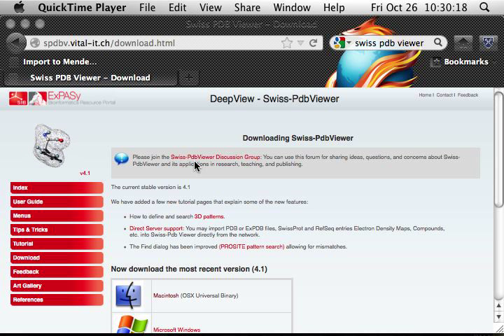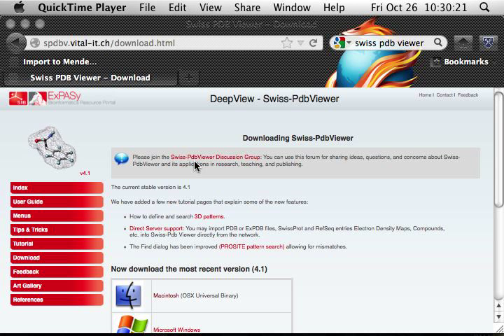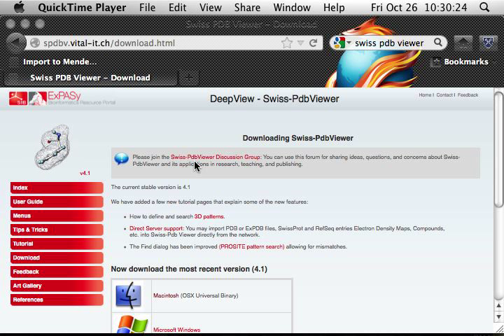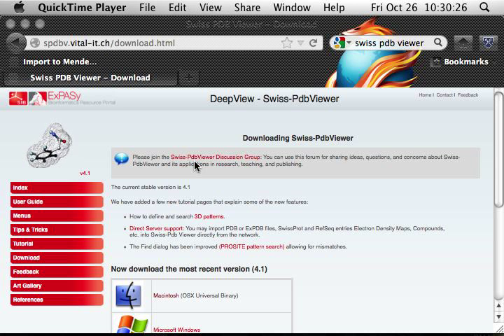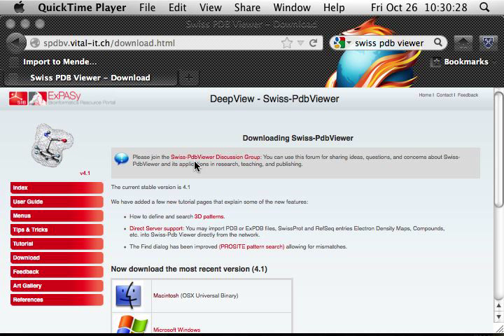I'm going to show you how to install DeepView, also called Swiss PDB Viewer, from the internet to your own computer.